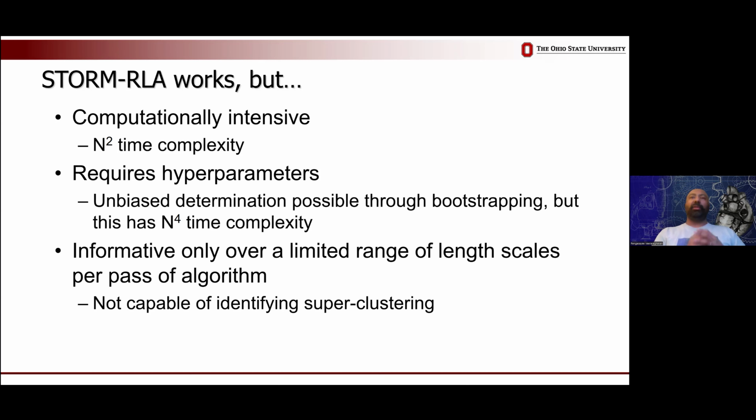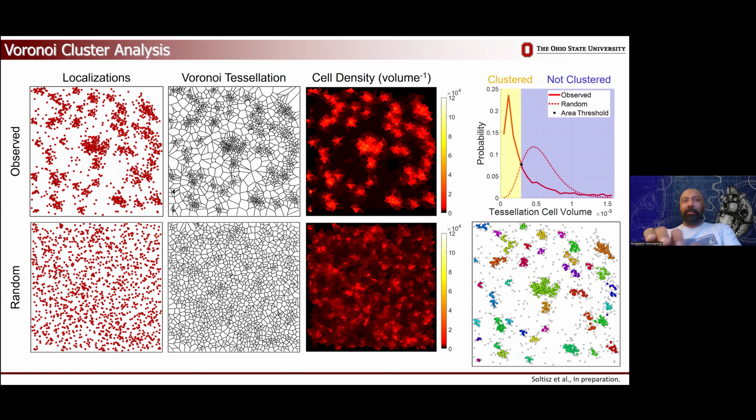So for all this, we thought, okay, what if we could build a better algorithm that is computationally more efficient, doesn't need any user-defined parameters, and will give us information in one pass on all the length scales present in the data. Took a bit of thinking, but then my postdoc Andy came up with a really clever idea. He used Voronoi tessellation, which is a mouthful for saying something very simple. We're going to take the space around all these points, and we're going to chunk it up by drawing lines in such a way that each cell in this image now contains the chunk of space that is closest to the one dot that is also contained in that cell.